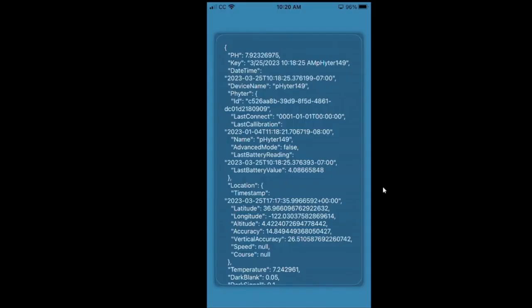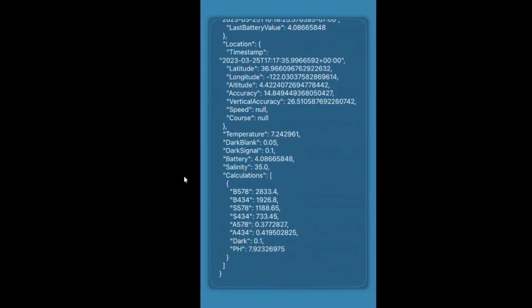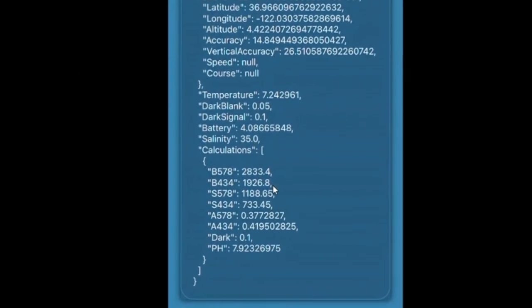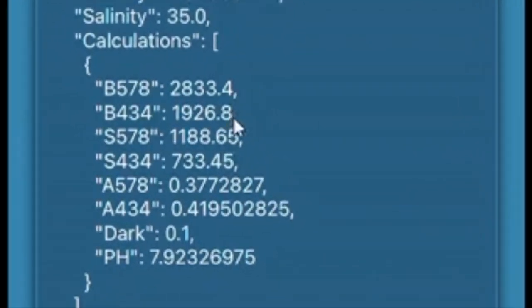You need to check the values of the instrument are in range. So scroll to the bottom of the screen. You want to make sure that the blank readings are between 1000 and 3500. The sample reading should be somewhat less because the light's being absorbed. And that gives an absorbance reading that's significant, i.e. typically higher than about 0.1. The dark signal should be a small number less than one.